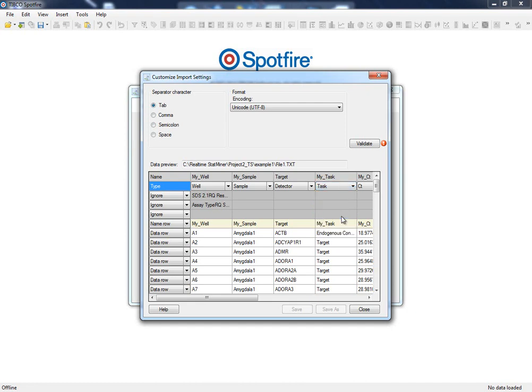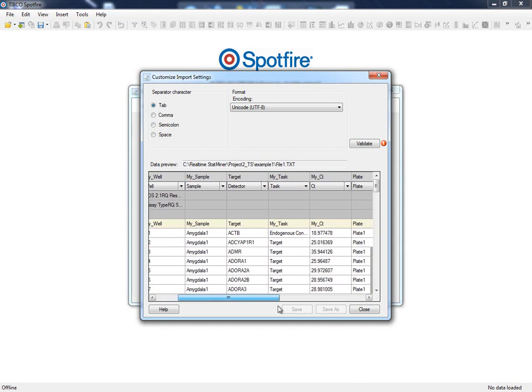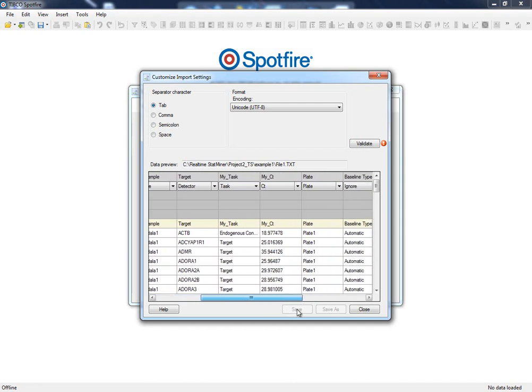Finally, we also have information about the plate column. It has been automatically detected, but when it is not provided, the application considers that every input file is a different plate, with no major implications in the analysis.